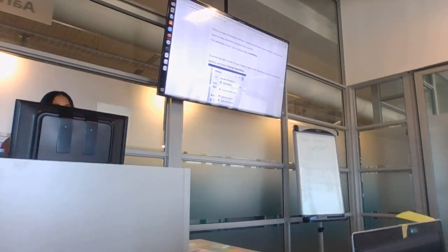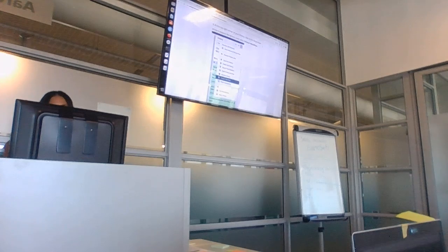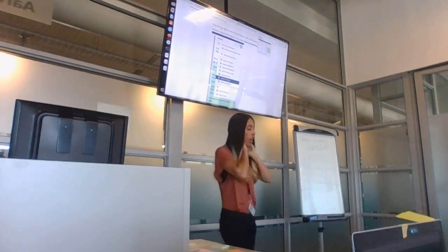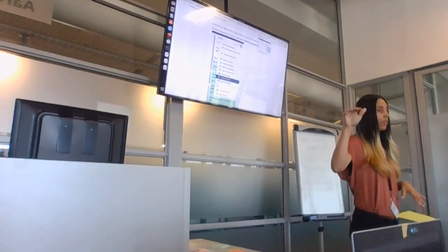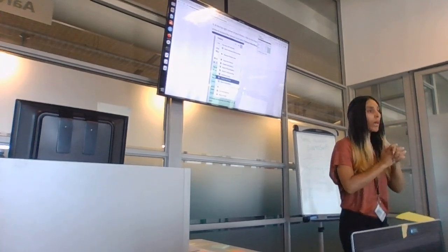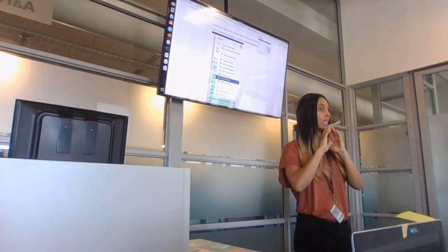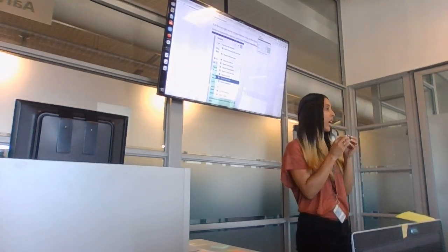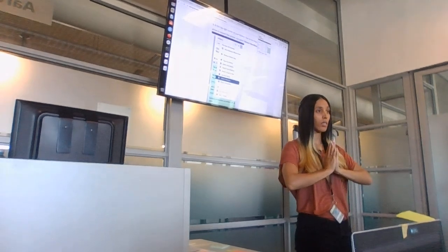Now, let's look at how you would turn this into a workflow. Obviously, if you were to do this on your own, you may want to put Kraken into the history where you actually had, like you call it, a dataset history, right?